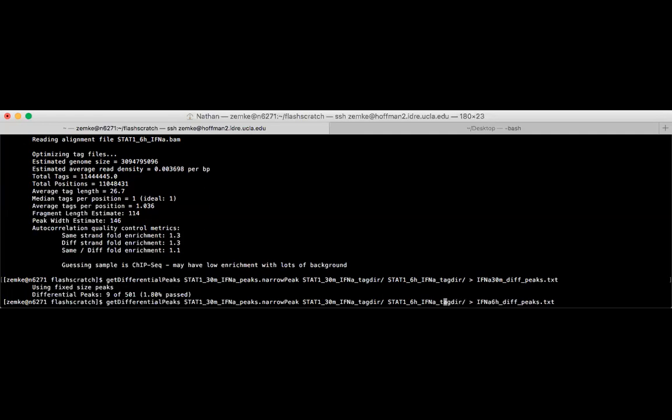So let's see when we do it with the 6-hour. I'm just going to retype it out. Differential peaks, STAT1.